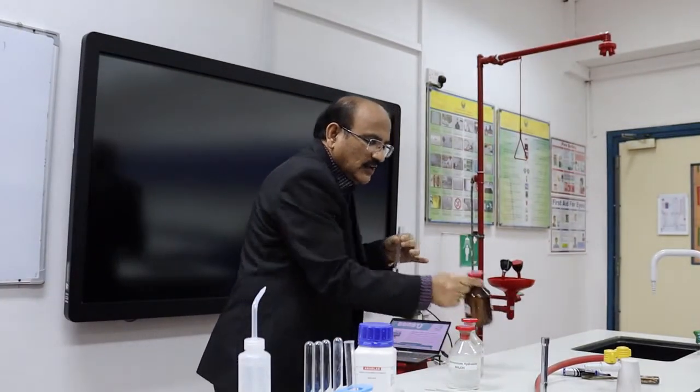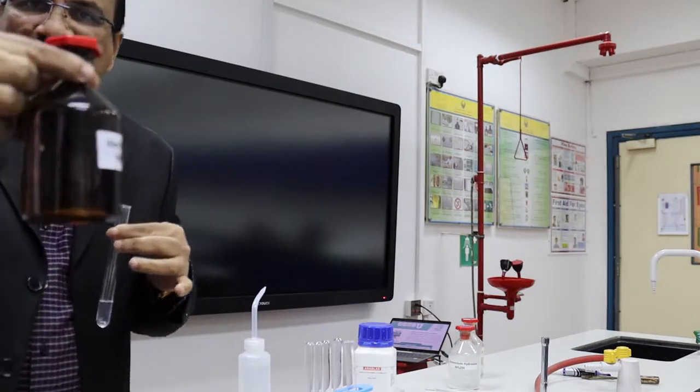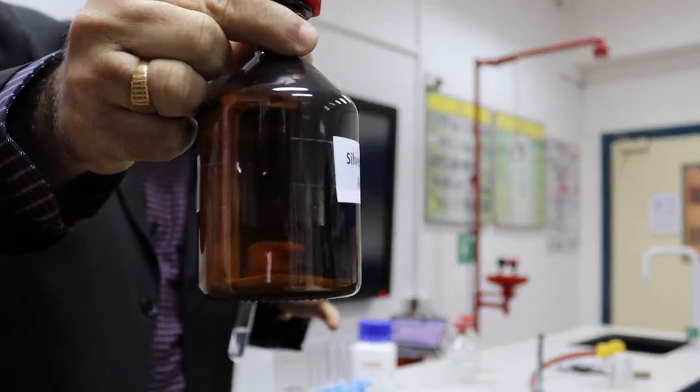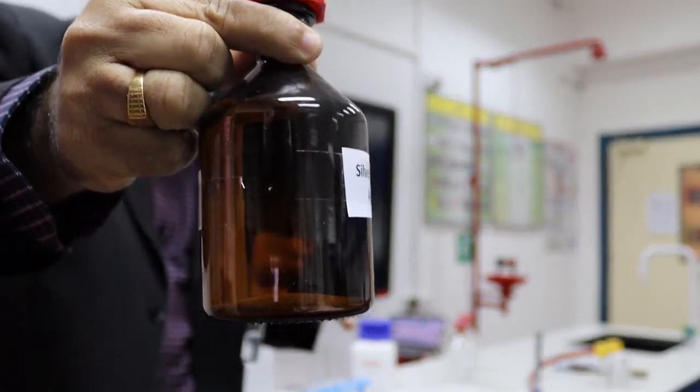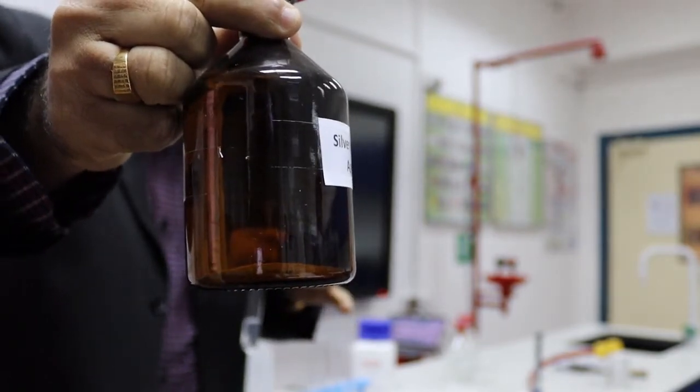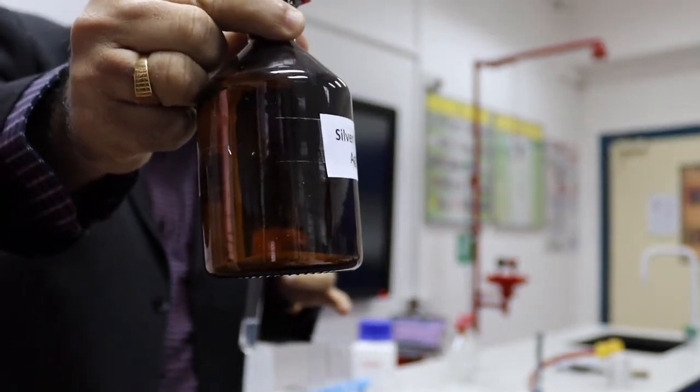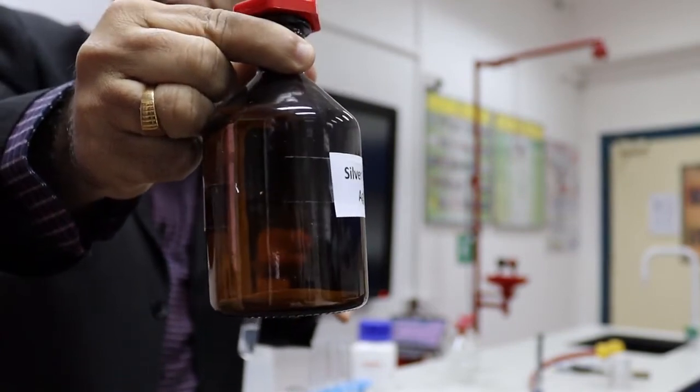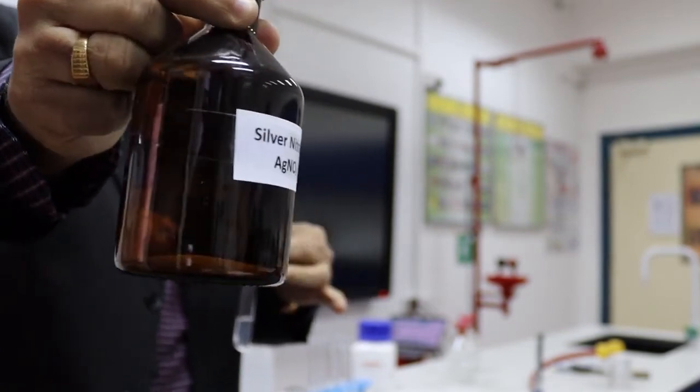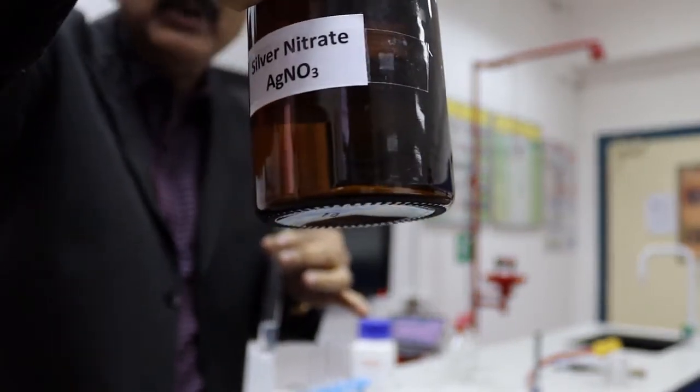So now we will take silver nitrate. You can see silver nitrate bottle. It is called an amber colored bottle, because it will undergo photochemical reaction. To prevent the energy of light, always silver nitrate will be kept in amber colored bottles.